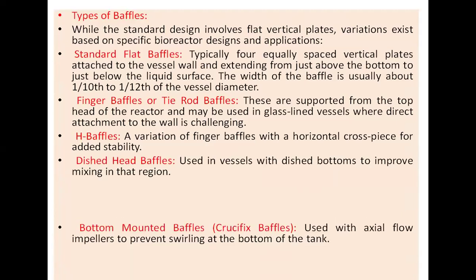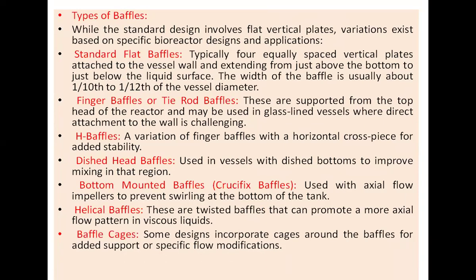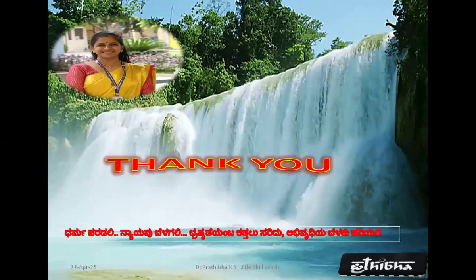Then the types of baffles: standard flat baffles, finger baffles, H baffles, disc head baffles, bottom mounted baffles, helical baffles, baffle cages, and finally integral baffles. For design considerations, one has to think about the baffle width, baffle length, and distance from the wall. So this is all about the baffles used in the bioreactor or fermenter vessel. I hope I made myself clear about the baffles, functions, types, and their importance.